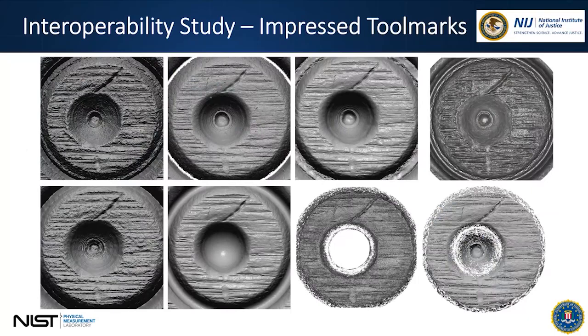Now, obviously, you could probably tell the tool marks, and you could probably make a pretty good idea on this one using VCM, but what do you notice? There's different quality to that data, right? Some of them can measure the firing pin in one go, some of them can't. Some of them have noisy dropouts, some of them don't. So each of these different technologies has their own little intricacies that as an examiner, you need to be aware of. And when you're purchasing these instruments, you need to test to make sure that it fits your need and your purpose.